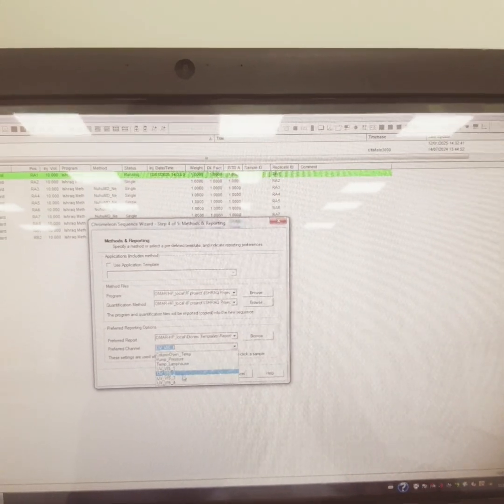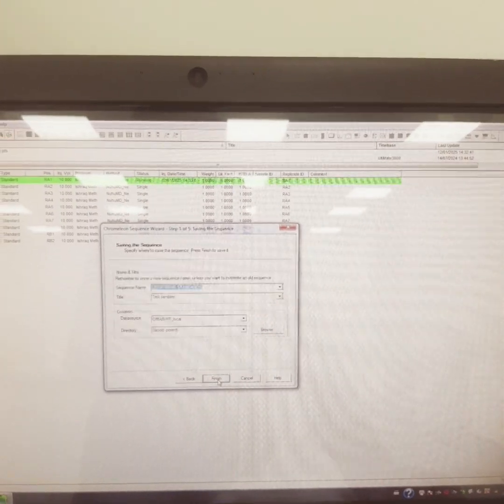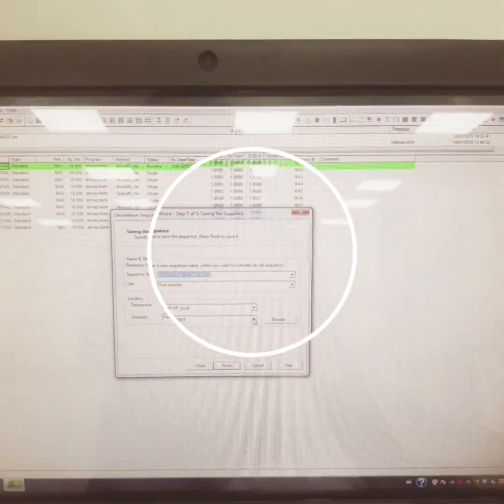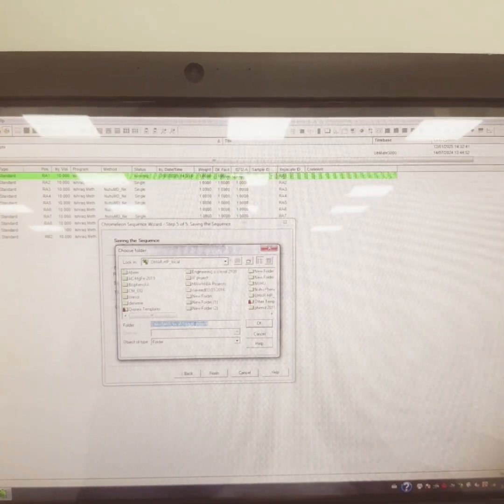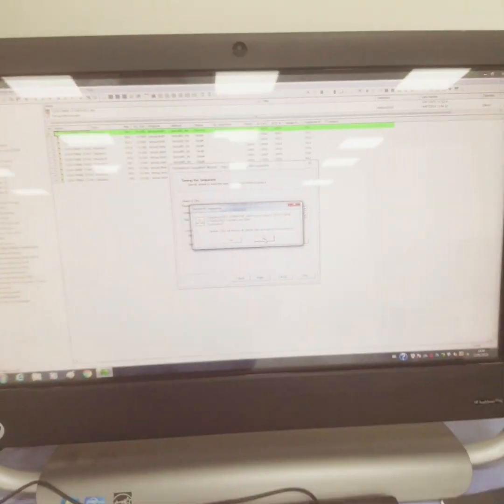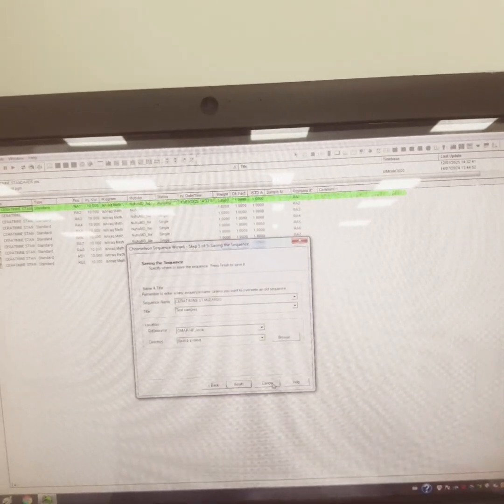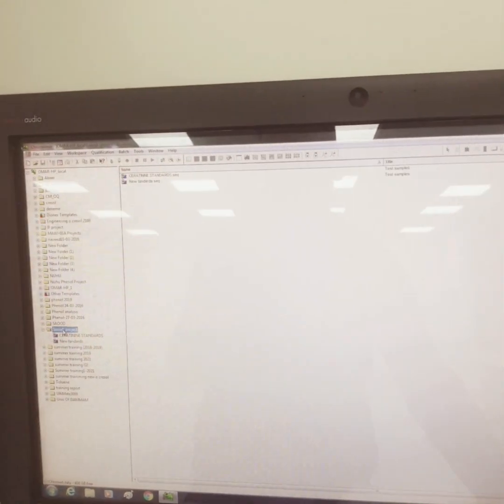And then what are the preferred channels I want to use, so column, temperature, oven, so I'm choosing this one, and then next, and then sequence name, test samples, and what is my directory. Suppose you can choose your directory, specify directory, so say cancel, and then finish. Okay, suppose I don't want that, so I'll say no, then cancel. Now this is my project which is going on.